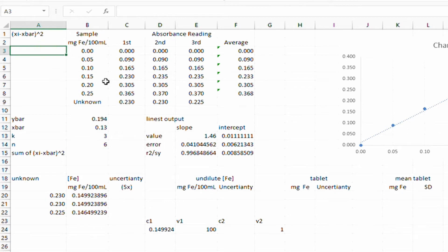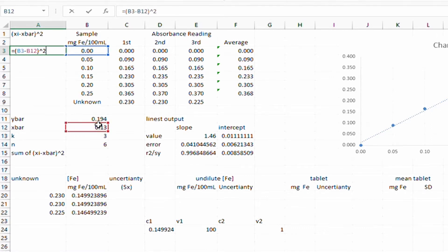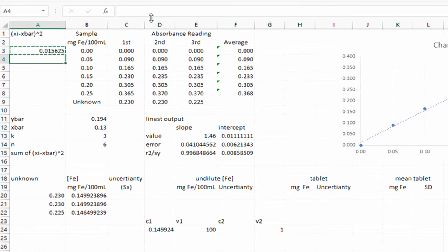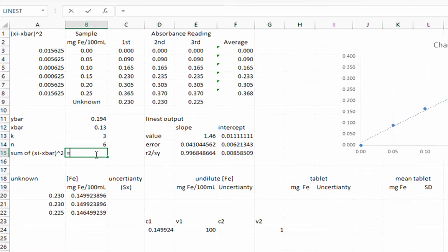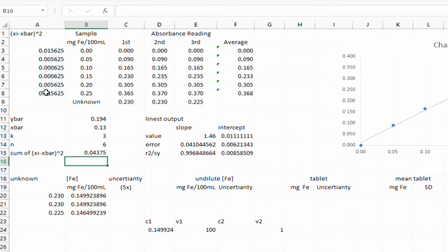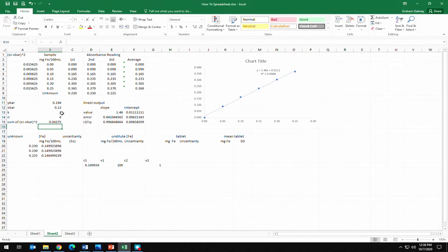For the summation term, we go equals, open brackets, take x minus the mean value, and square it. Adding absolute cell referencing to the x-bar value, we can copy and paste that formula down for all calibration points. Then we use the SUM function on those six squared-deviation values to get the summation needed for the S_x formula.